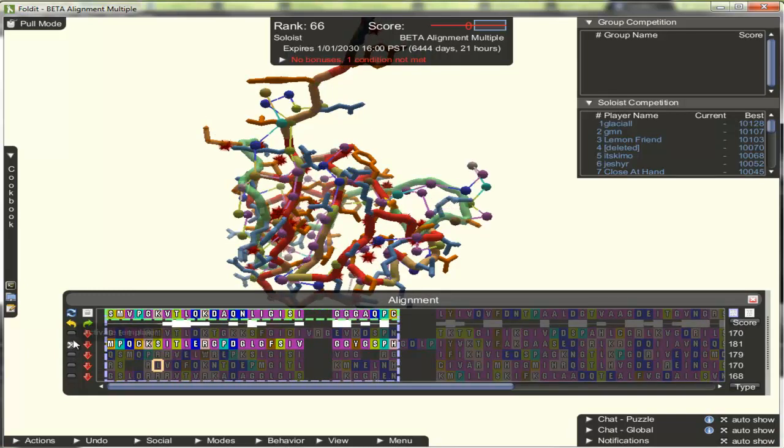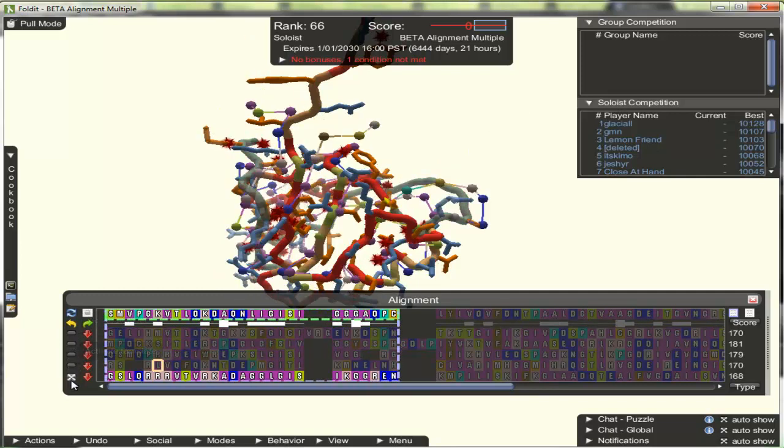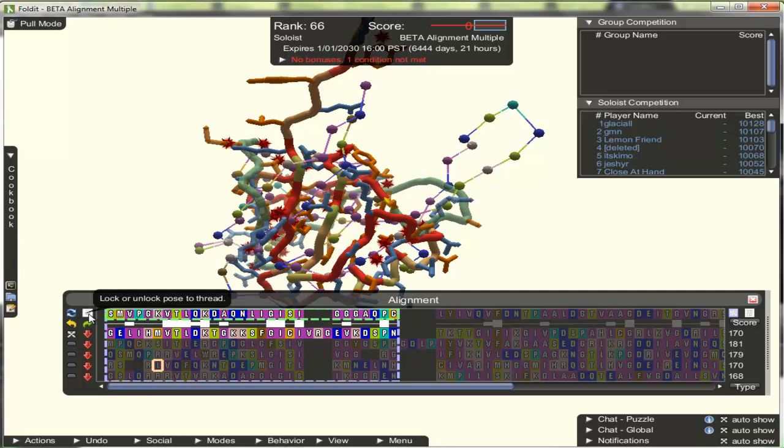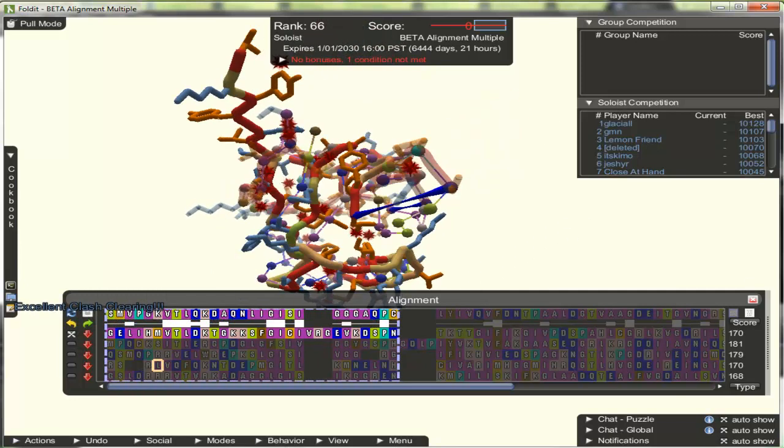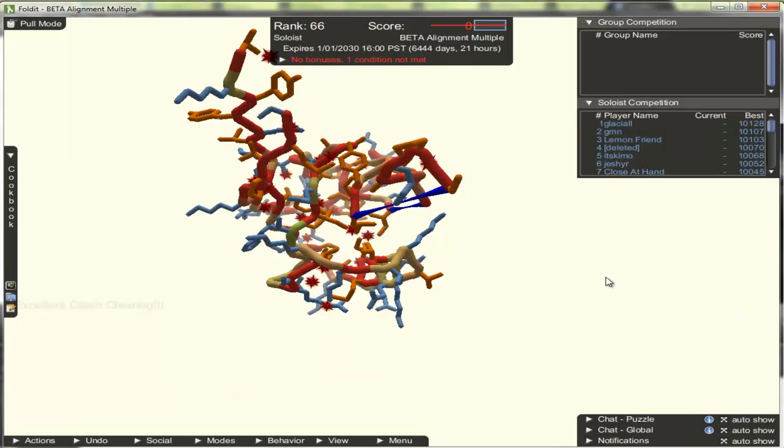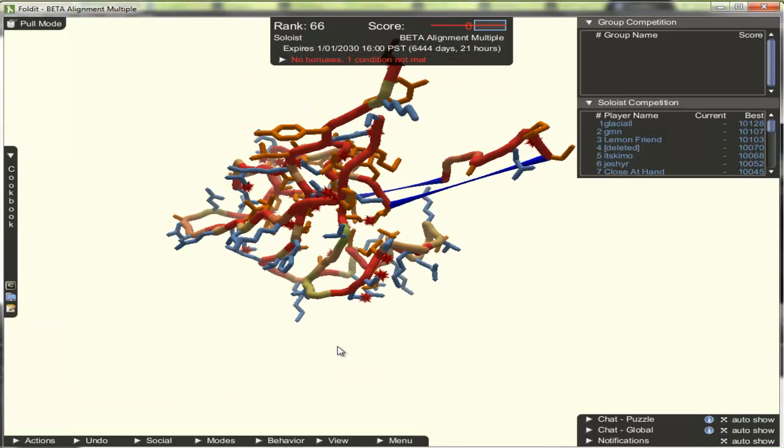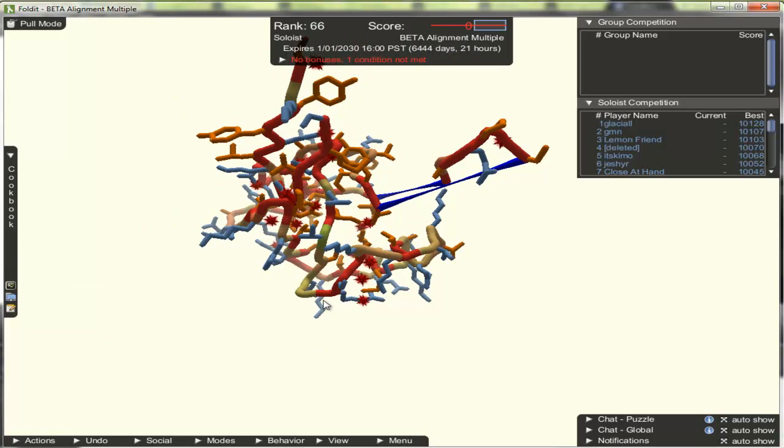Now we can cycle through the different templates that are available to us. I'm going to go ahead and pick this one, and then lock to that. And now we have two different regions of the protein that have been threaded to two different templates, and that is partial threading.